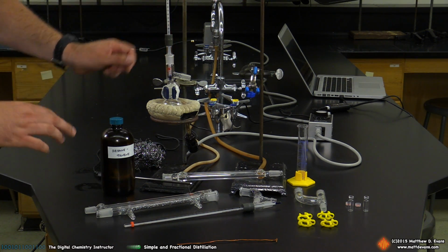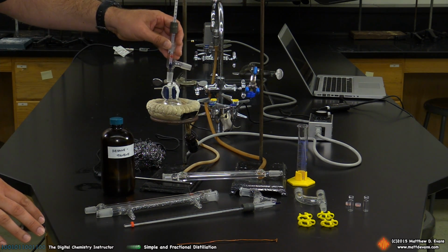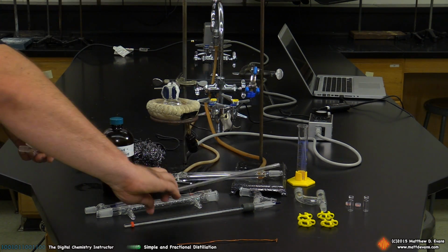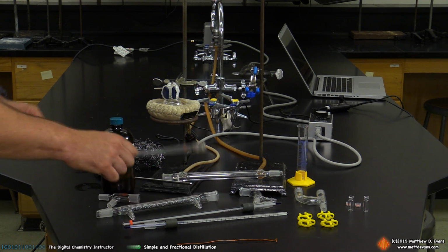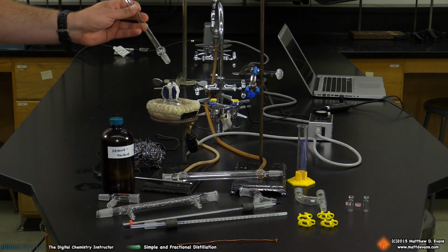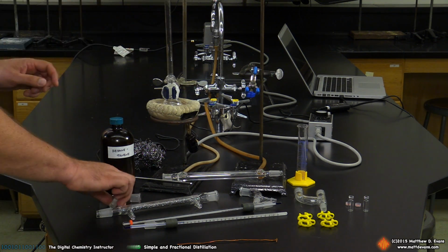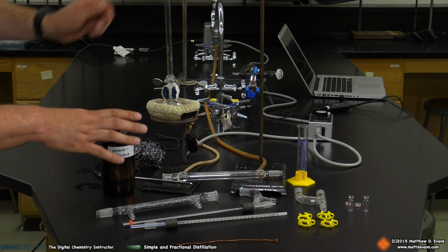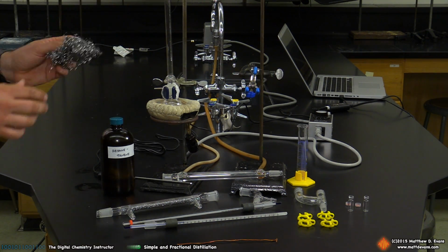So this is a simple distillation. Like I said, a condenser goes here. Briefly, I'm going to show you a fractional distillation setup. Instead of having that like so, in a fractional distillation we're going to position one of these, which is a fractionating column. This is going to go right on the round bottom flask, and then the three-way adapter is going to go up top. As part of the setup for the fractional distillation, we're going to stuff this column with some material, which happens to be steel wool.